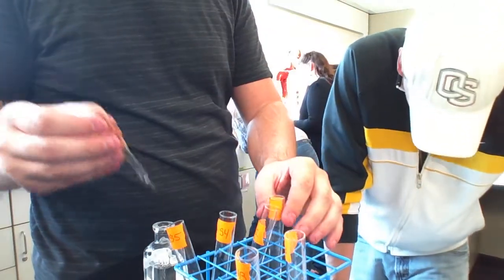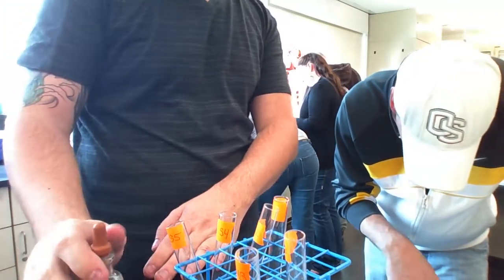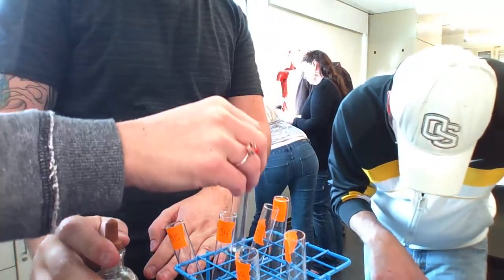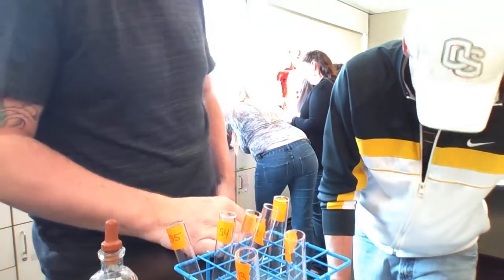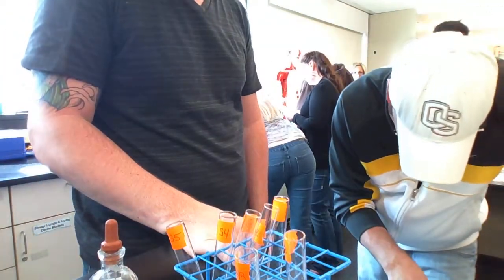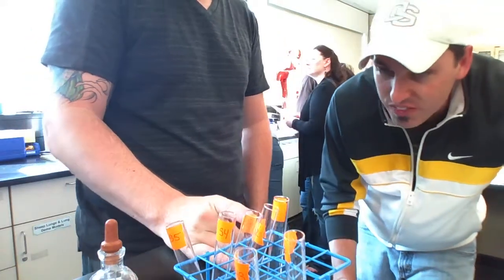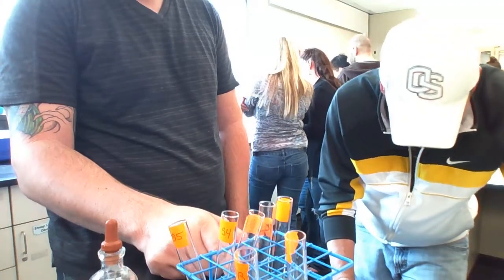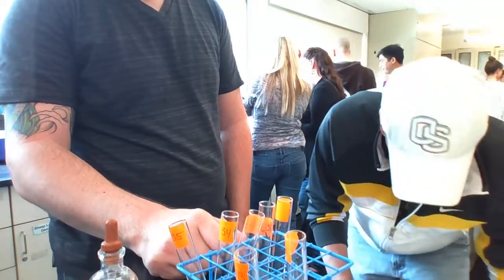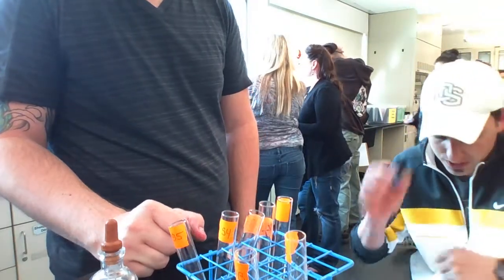Hold on. I thought he was saying 5 drops of everything. It's okay, let's just slow down and start reading and see where we're at and what we've done. So right now, what is in each of these? Everything has 5 drops of lipase, except for tube 2.